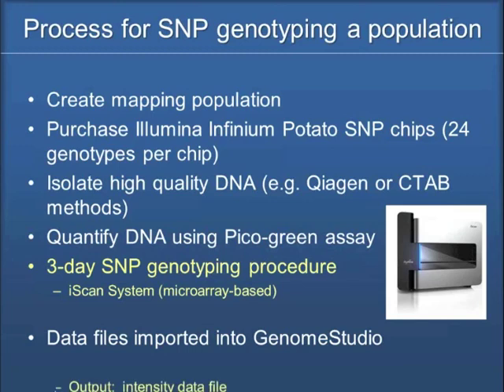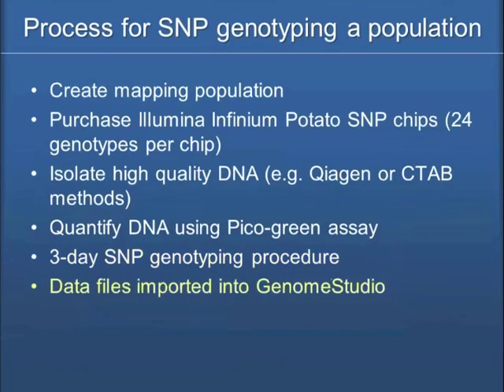But after it's really gone through it, it's actually been about a 3-day procedure, and it's a microarray based system that we use. And so what comes out of this is an intensity data file.